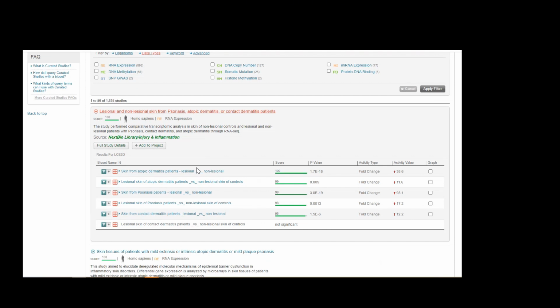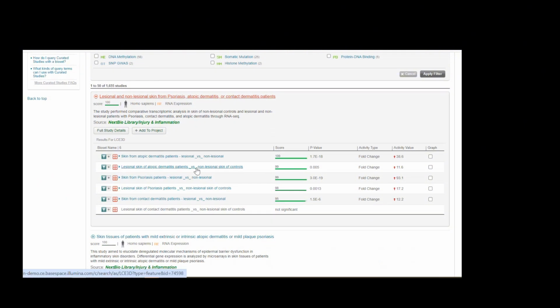It is upregulated in all 3 phenotypes. Scoring normalizes for omics platform differences across studies and for variable numbers of significant genes after removing insignificant genes. Links to our original 2010 article, Ontology-Based Meta-Analysis of Global Collections of High-Throughput Public Data, and other resources will be shared at the end of this tutorial.